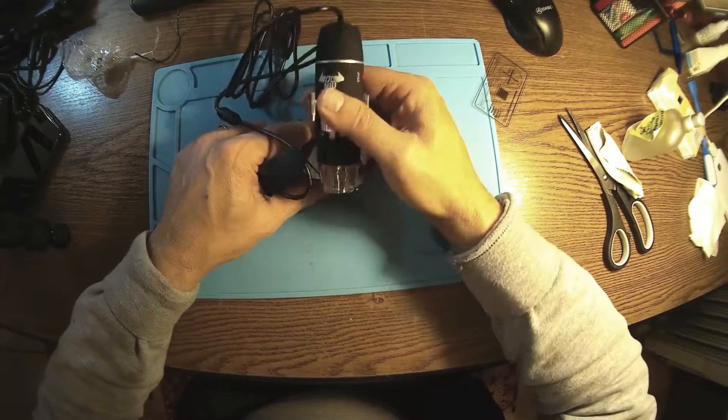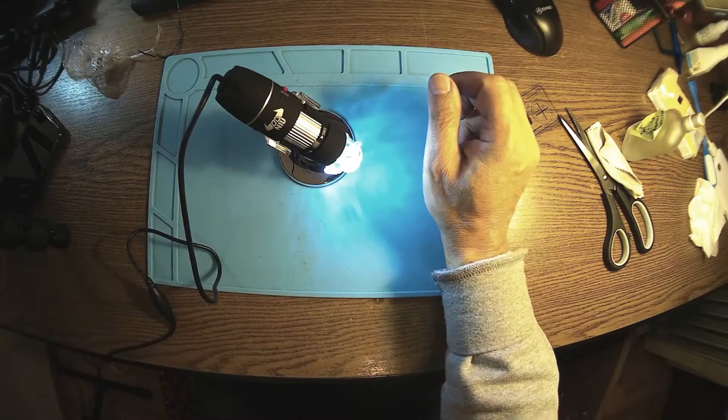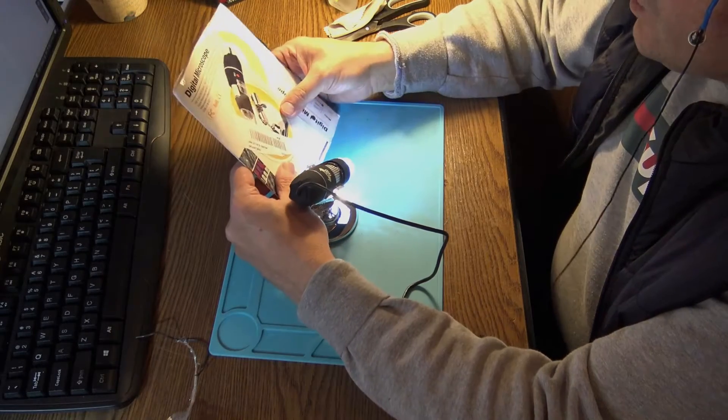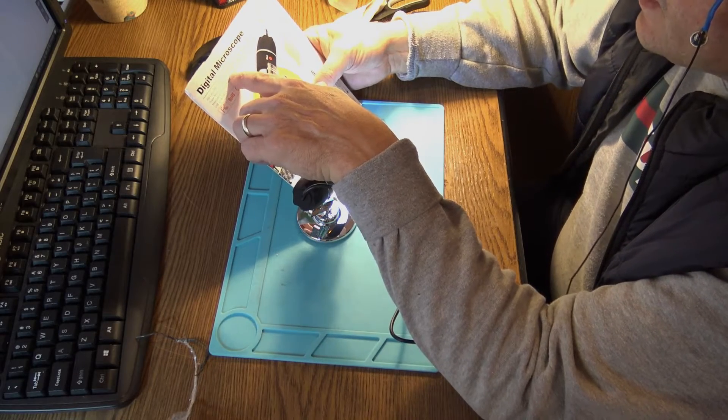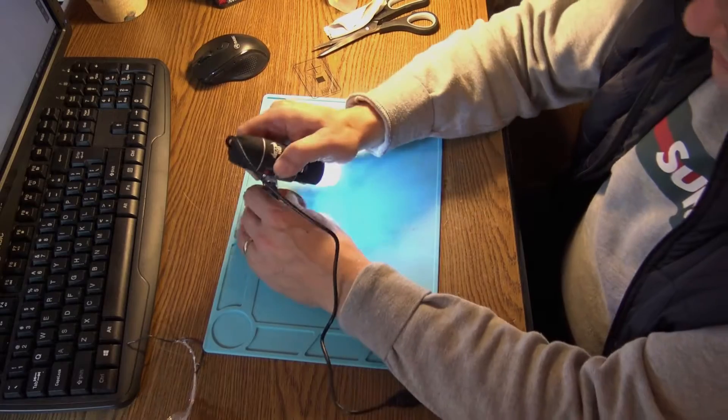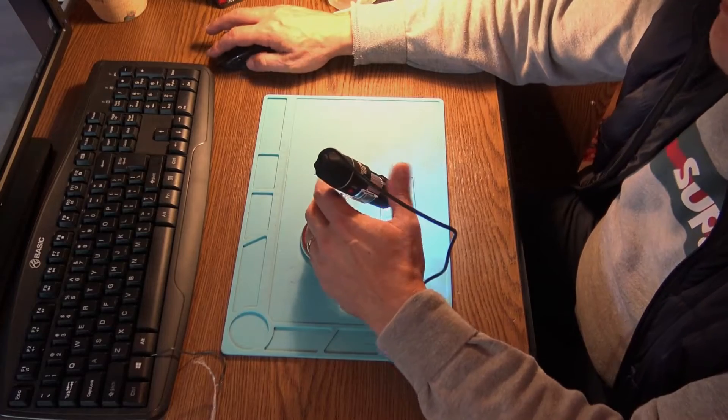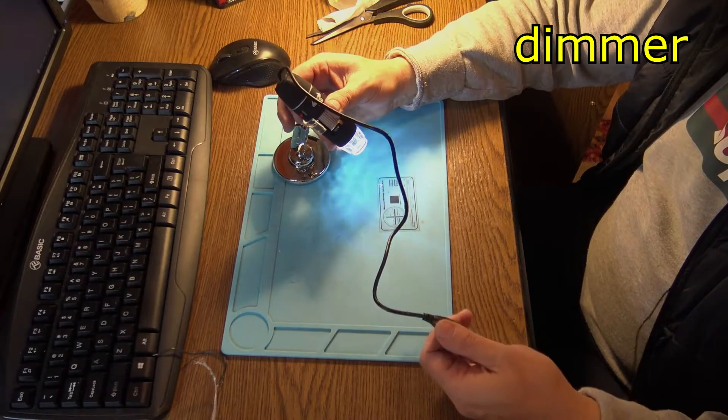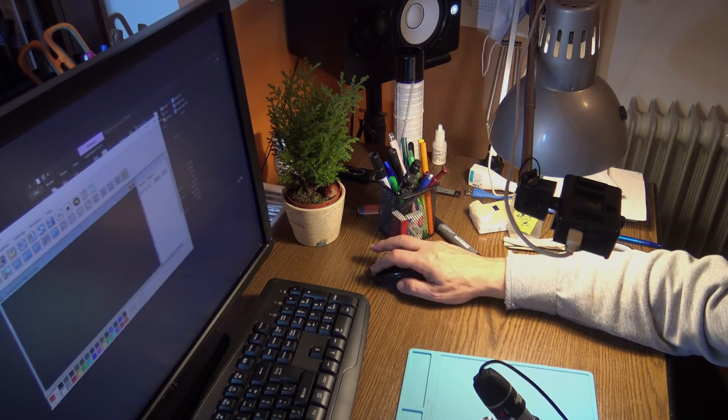USB, I think this is USB 2. They advertise 500 times magnification, of course, resolution 640 by 480 to 1600 by 1200. I don't believe that low resolution, but for this purpose I think it's okay. Let's see what we got here. We already have picture on the screen. Here we have the LED power light. Let's install the software.